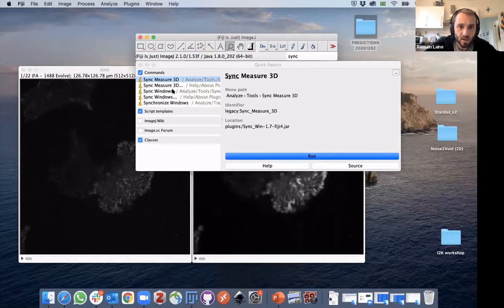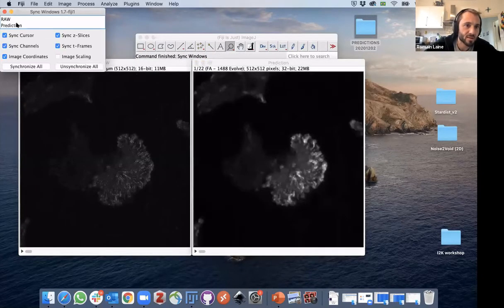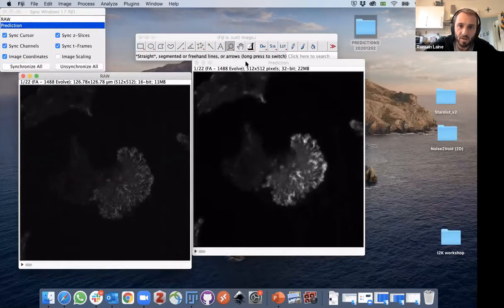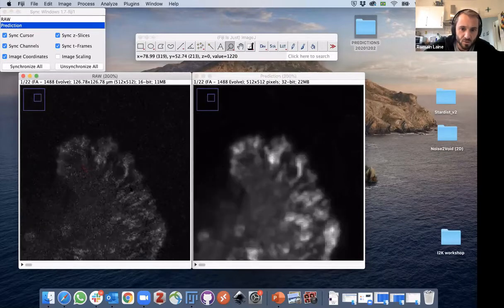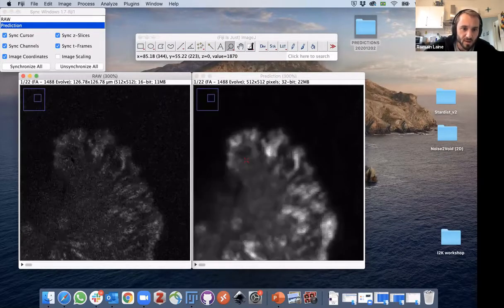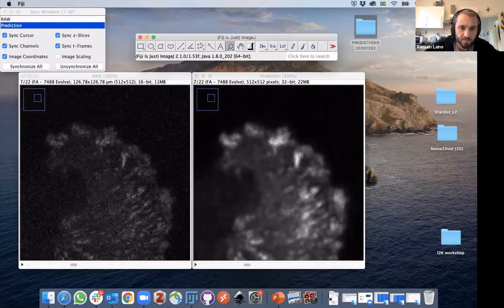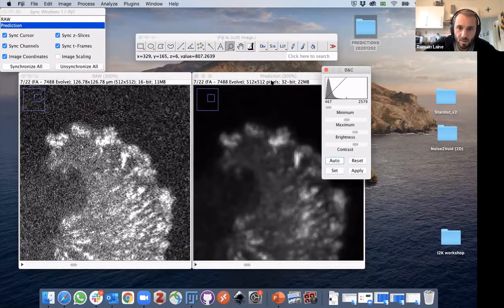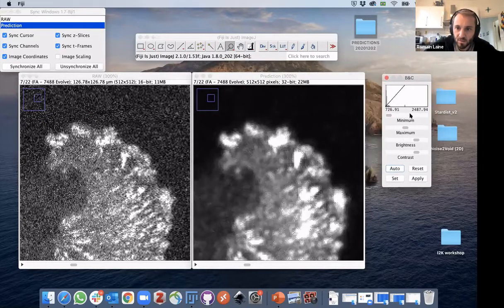So I'm going relatively quick here because that isn't a Fiji workshop, but if there's anything that you need help with, just give me a shout. And now we can therefore zoom onto the different parts of the images and also go along. There you go. Let me just improve a little bit the display contrast on those guys.